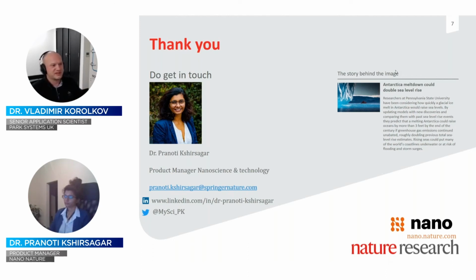So excellent. That answers that. Thank you very much, Vladimir, for that answer. We have got to the end of the session, but we've got a couple more questions. So what I suggest we do is we just carry on for a few more minutes and answer the questions that are outstanding. If people do need to drop off the call now, that's absolutely fine. Like I said before, the session is being recorded, so you'll see all this when the recording comes through tomorrow. So we'll get to the last couple of questions. Firstly, a question for Vladimir from Tamizi. Thank you, Vladimir, for the excellent presentation.